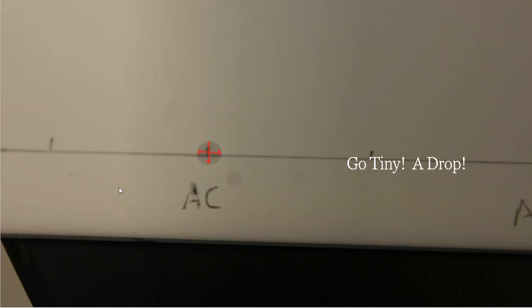Some of it's going to stay behind. And I get this real long smeary thing that begins to happen on my plate, and I don't really want to see that. I can do measurements with it, but it's not ideal. All right, so that's the kind of shape that you're after on the TLC plate. You want something very small. You want something that looks like a circle, for goodness sakes.